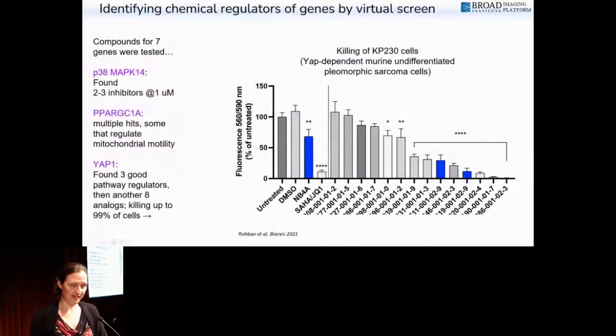So that's all very nice, using existing known gene compound pairs to validate the method. But we wanted to prospectively test it. It's easy enough to predict stuff we already know. Let's make sure we can actually discover something new. So we made these lists for every gene in this experiment.